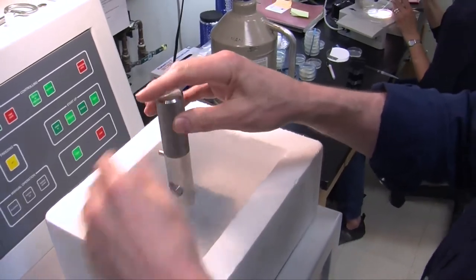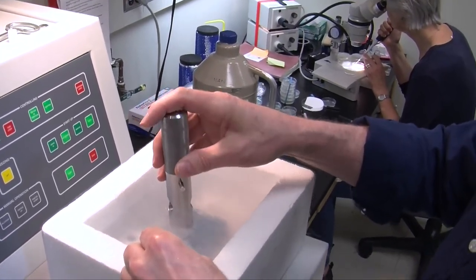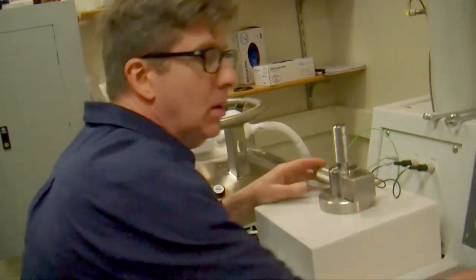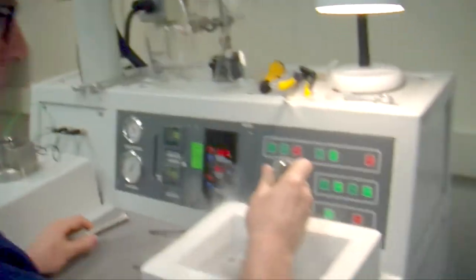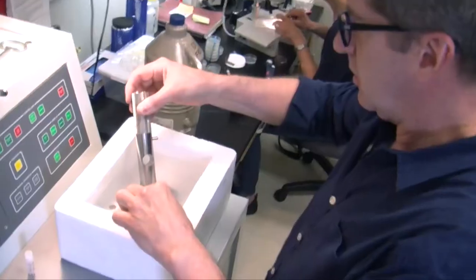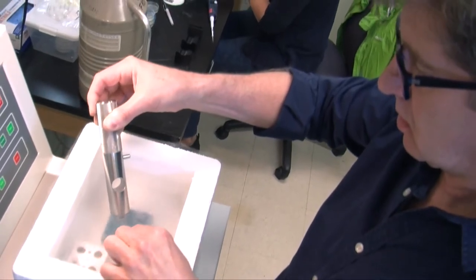So you freeze these samples so fast that they're frozen into vitreous ice, and then with the freeze substitution part of the process, we can take these samples that we've frozen and we can embed these samples in plastic so we'll be able to maintain that ultrastructural preservation at room temperature. That means that they're basically fixed forever.